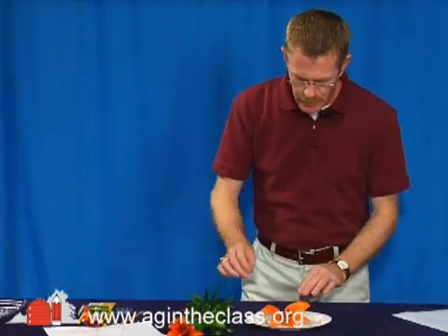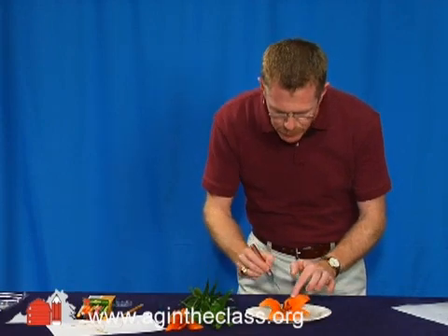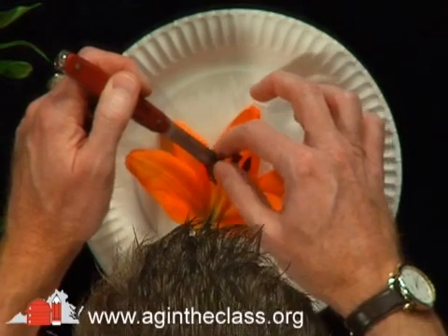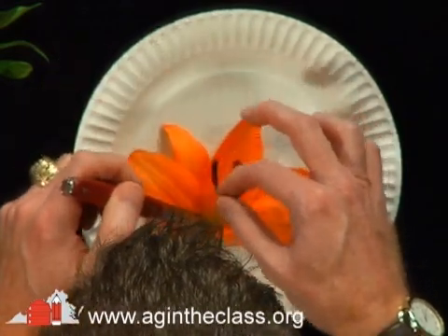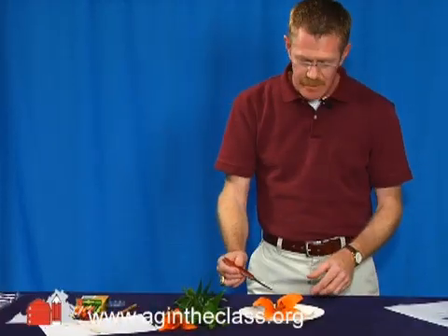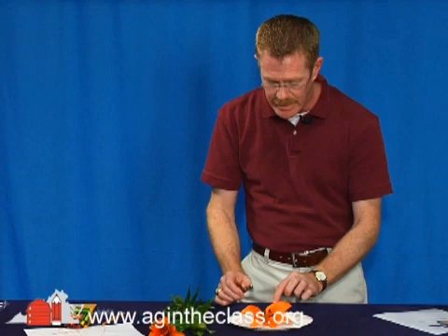After you've removed the petal, we want to go in and take one of the stamens out. The stamens are these little things here in the center that are holding the pollen. I'm going to take my knife and go in there and lift that center one out and then pull that right out. The stamen actually has the anther and the filament attached to it, and that's how they're attached down at the bottom.